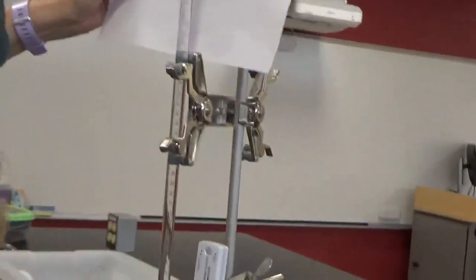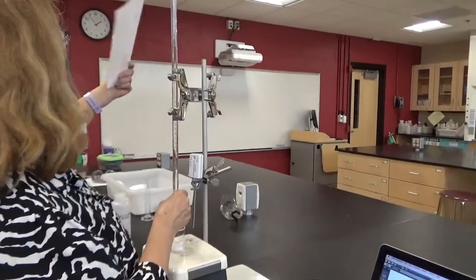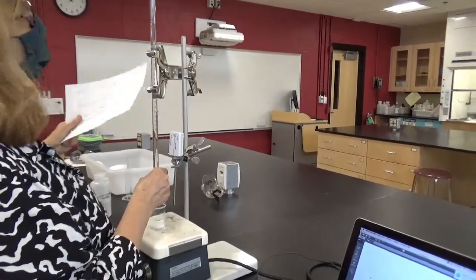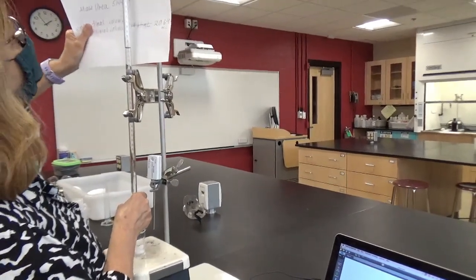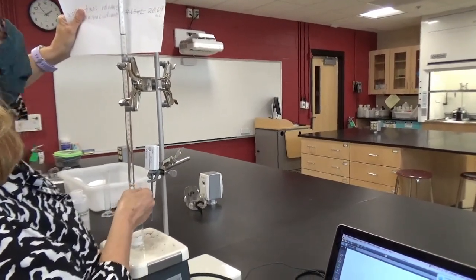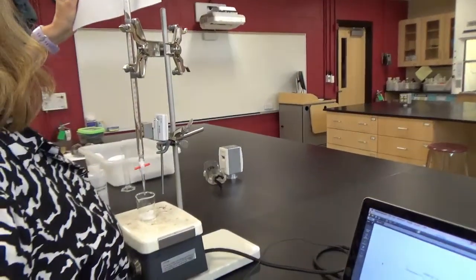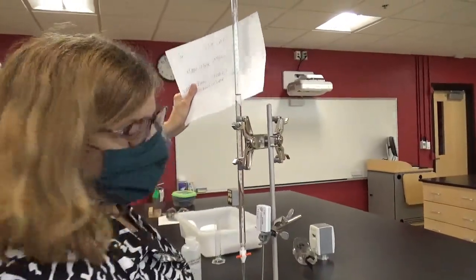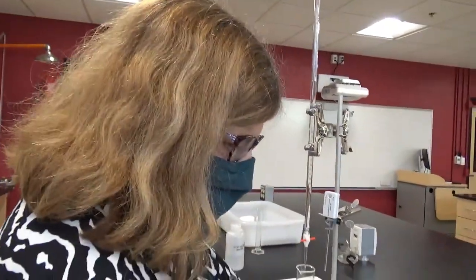Oops, I have to put the beaker under it. Did I do that right? I'm not sure about that. Oh, well. 19.65, 22. Yeah, that's right. Except it wasn't 19.65, it was 20.69, remember?